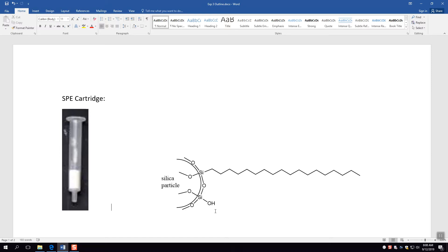The reason that we're going to use food coloring is not because it's non-toxic, although that is an added benefit — it's relatively non-toxic. Basically the benefit is we can actually see what happens in this silica gel column. So for example, if you take some red or blue food coloring solution — and for the most part at the beginning of the experiment we're going to use blue food coloring — what will basically happen is you'll put a blue liquid in this part.